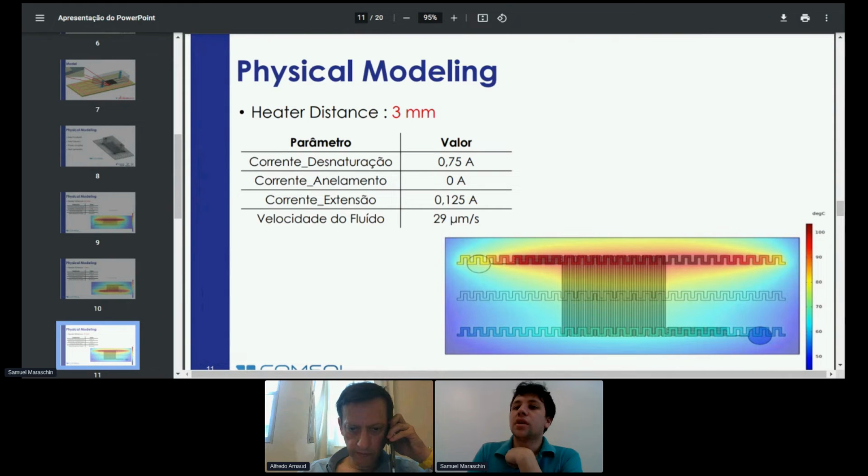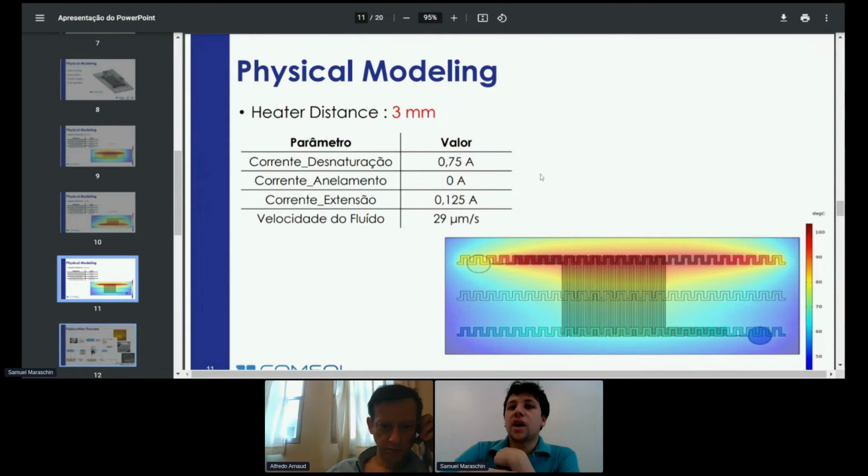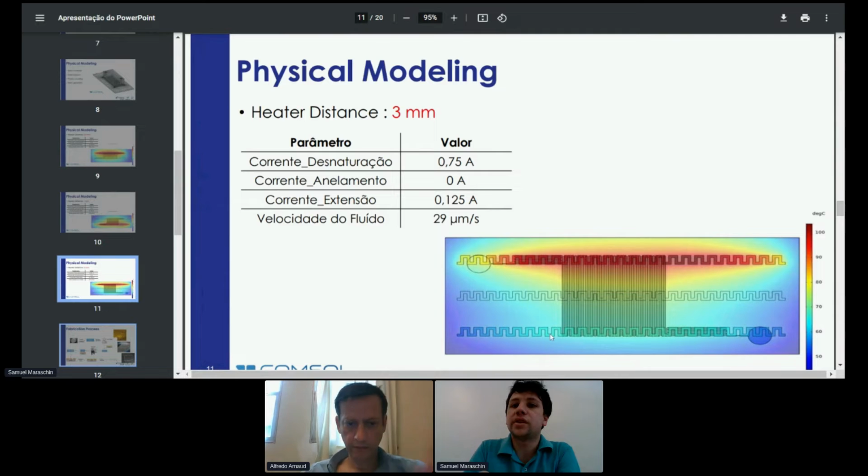So, in order to fix that, I concluded that it was not possible to do that with small distances. So instead of performing a cycle starting from this zone, then the middle zone and the third zone here, one cycle would be accomplished by using this top heater as the first zone, the third heater as the second zone, and the middle heater as the last zone for extension. If you remember the sequence of the amplification.